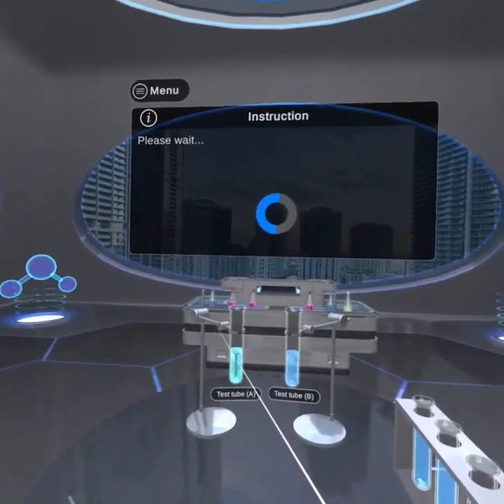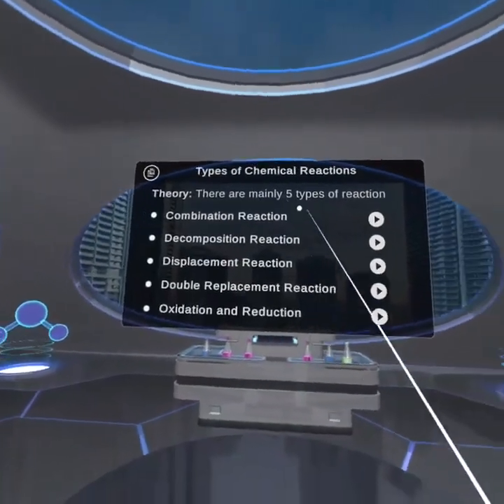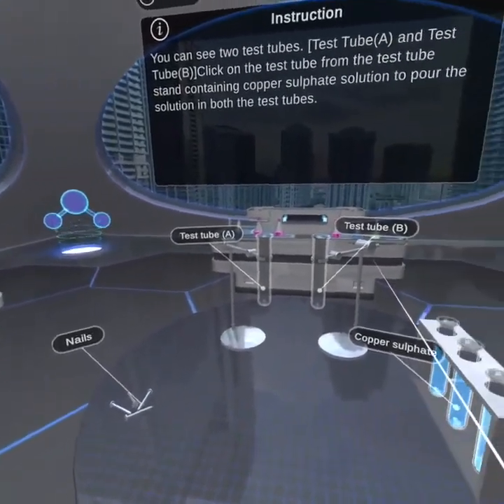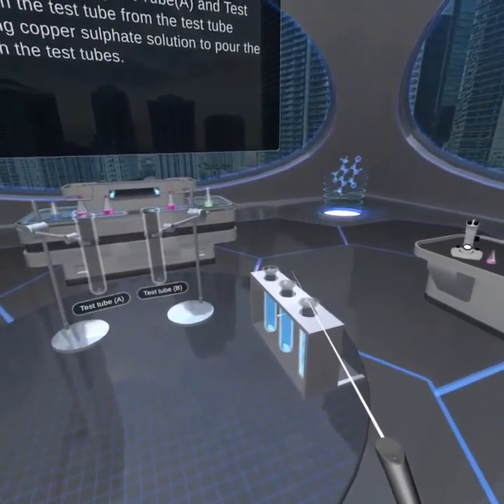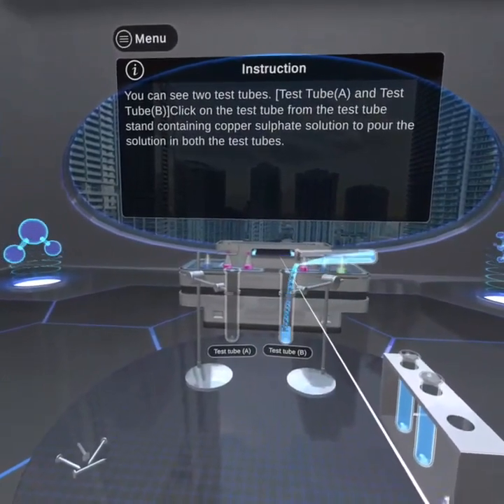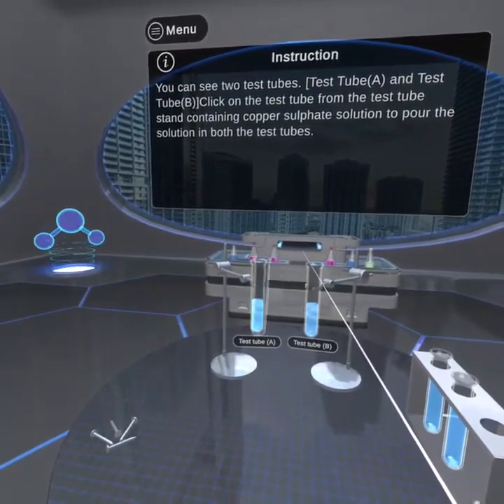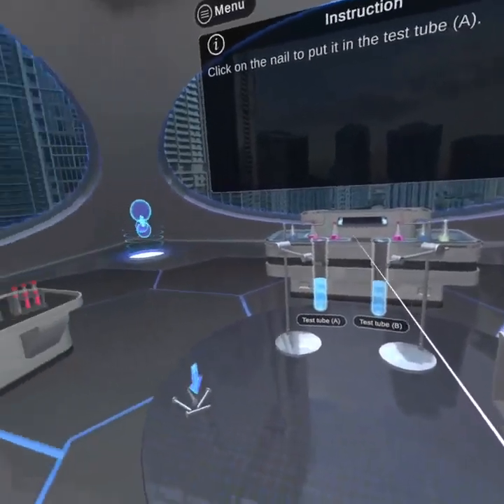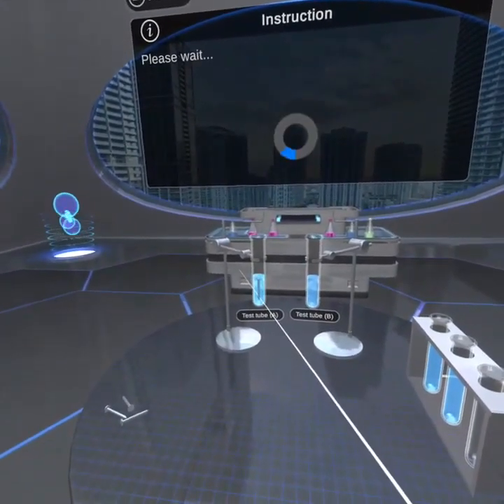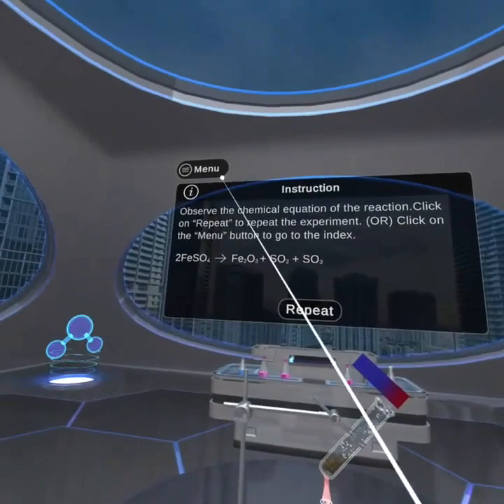Click on the nail to put it in test tube A. Please wait. Observe the experiment.